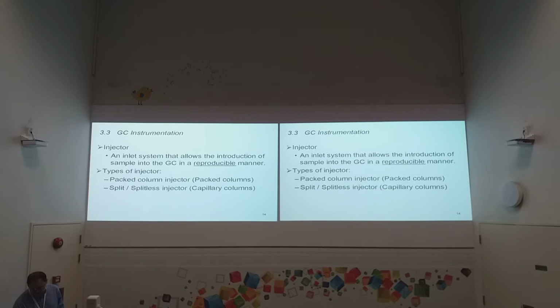But this technique was developed more than a few decades ago. Actually, the original chromatography separation was discovered more than a century ago. Then, with the advancement of technology, the industrial instrumentation developed, and now we have fully automatic GC instruments.